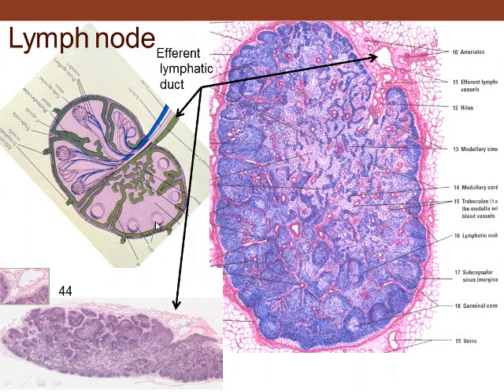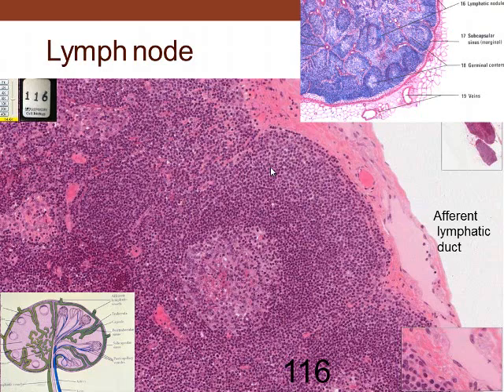And you have these follicles that are located in through here, through there, germinal centers. You can see where blood supply comes in around these, and so the blood side comes in and out this hilus region, which is right in this region. Blood comes in, and the lymph exits the lymph node at a certain place at this hilus region. So if we look at that, we see the capsule, and these are afferent lymphatic vessels. That is, these are vessels that are located all along through here, and they bring lymph into the lymph node. Even though it goes out only in one place, it comes in multiple places.